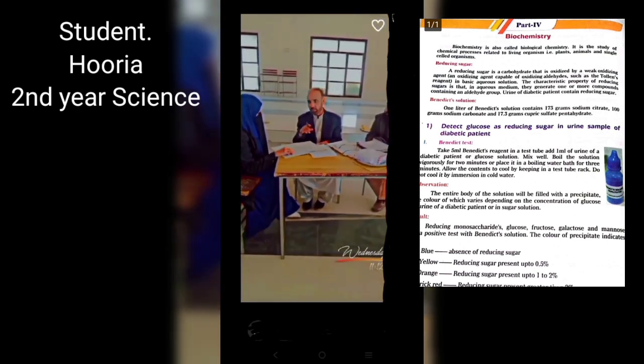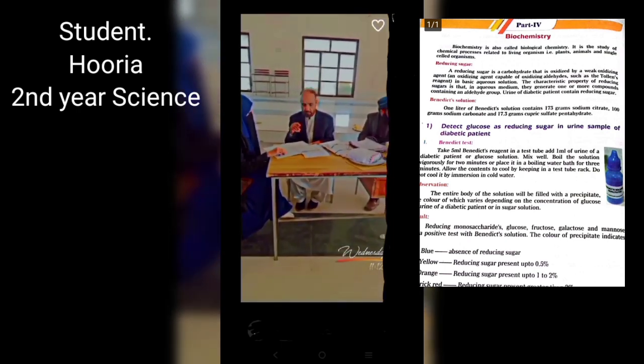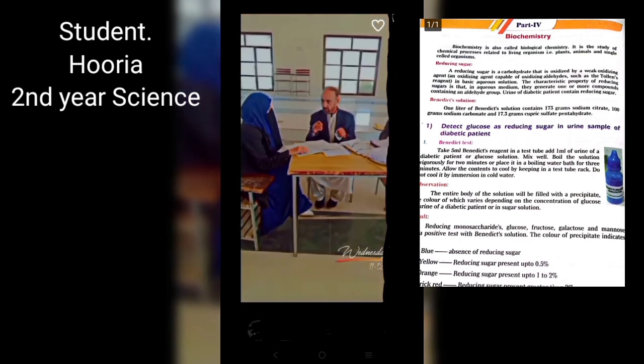What is its conclusion? This concludes the Benedict test for detecting sugar in urine.